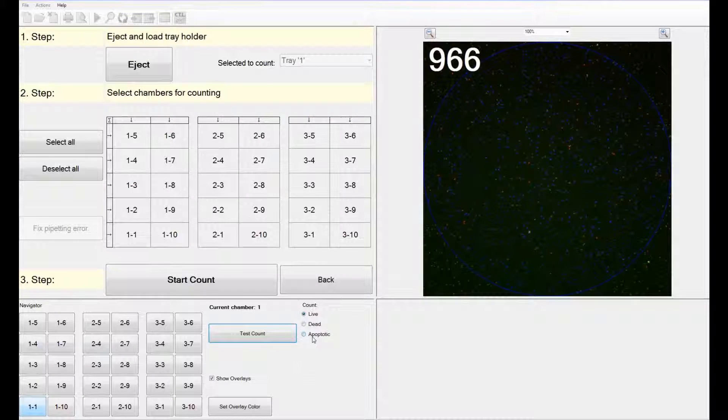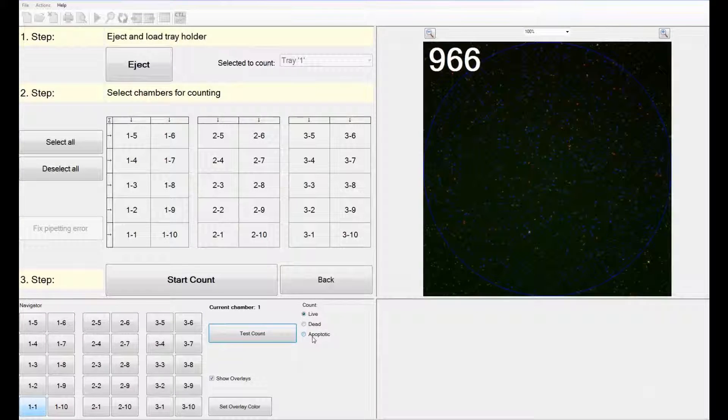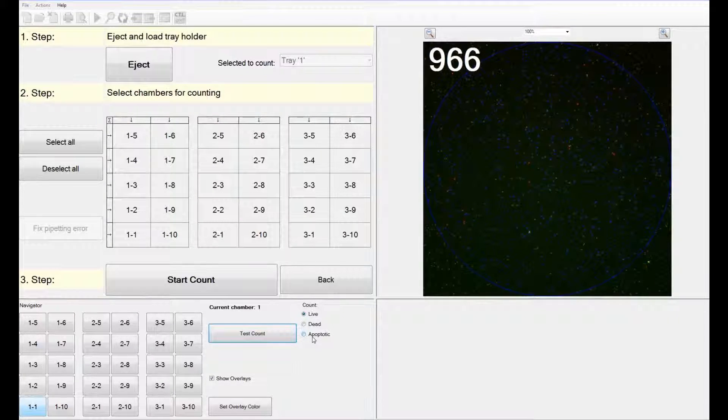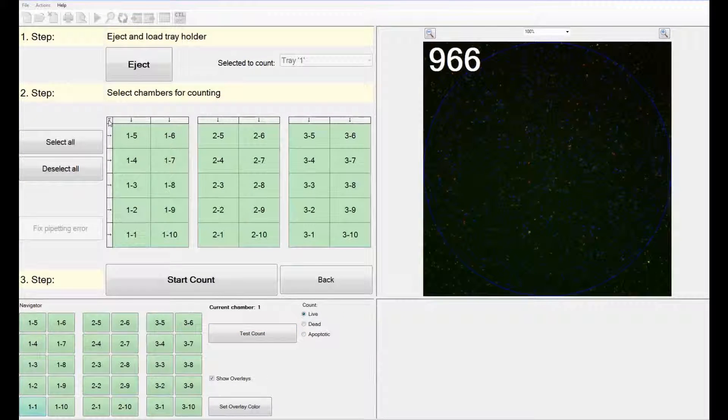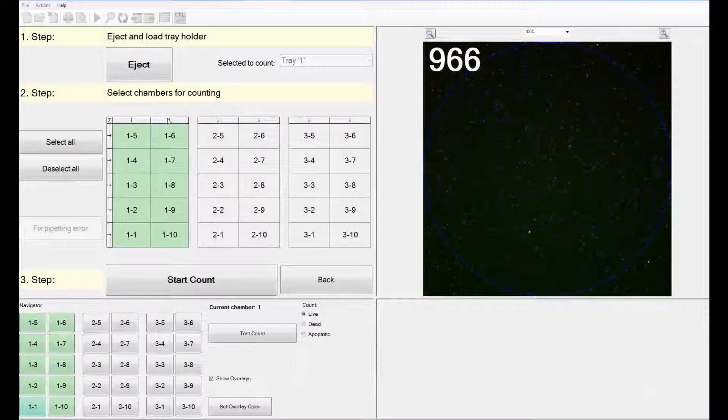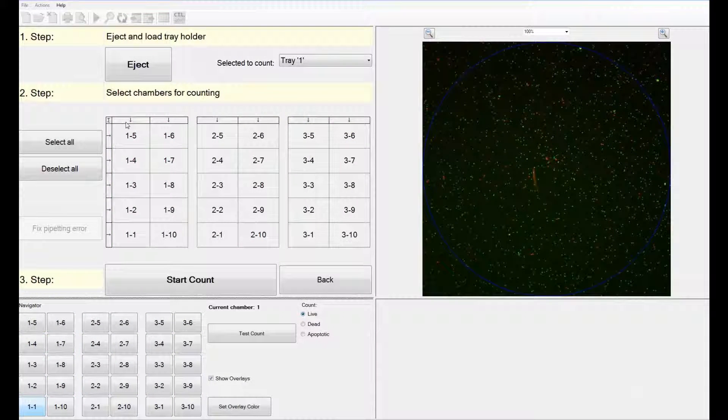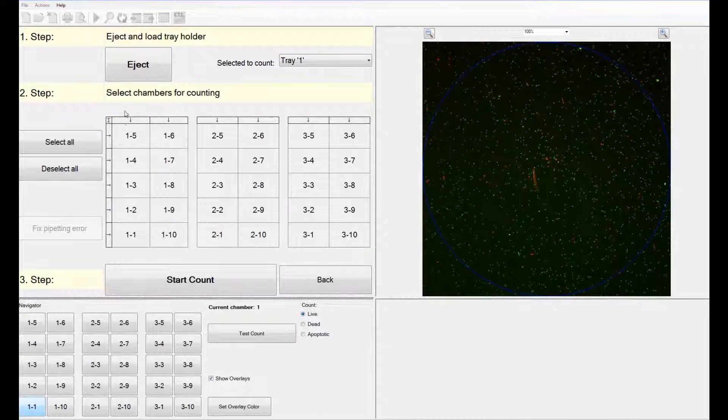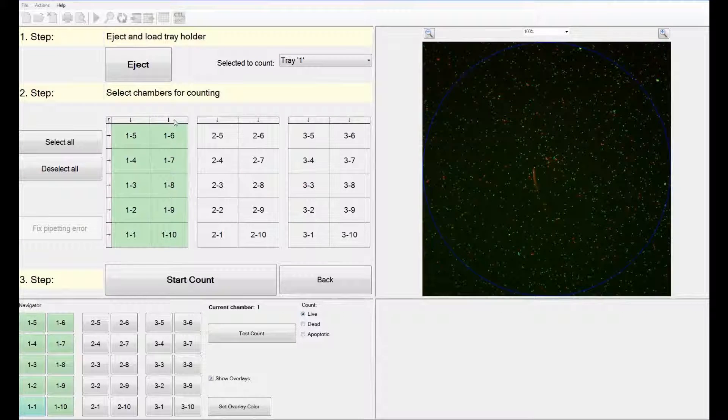You can either select all of the chambers, or you can select a few rows or columns. I am going to select all the chambers in my first hemocytometer.